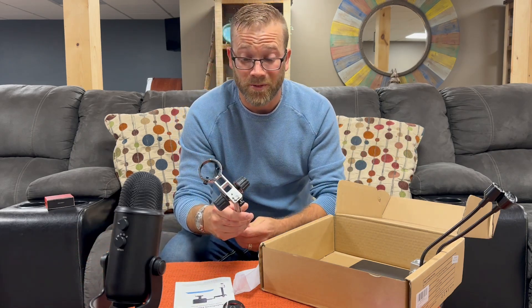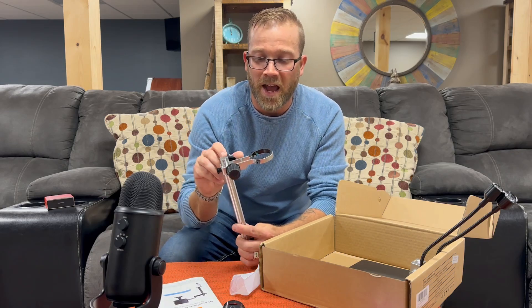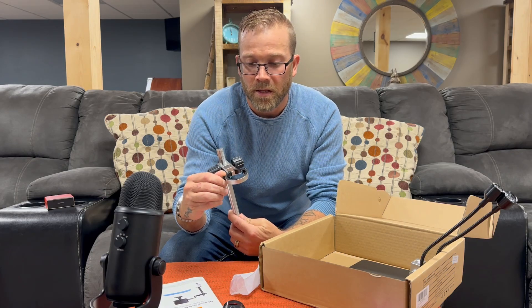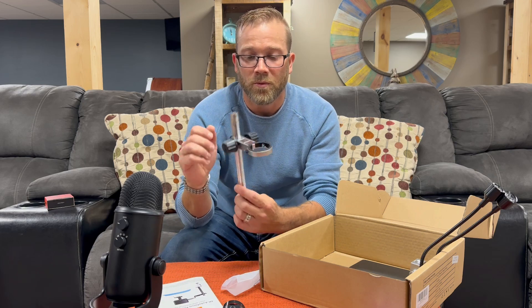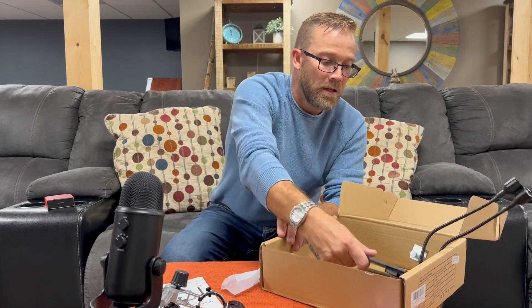This is all new to me so during setup I'm gonna have to figure out how it all goes together. This piece is obviously for the screen — it slides in and clamps down. This is for raising and lowering, and here is the pedestal. That is all that's in the box — now let's try and get this thing together.